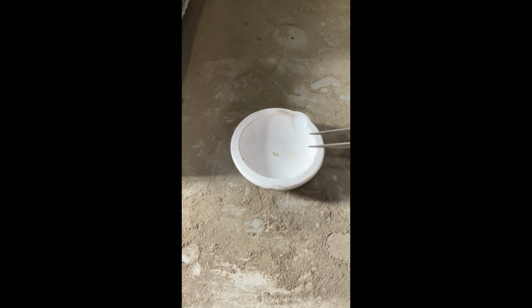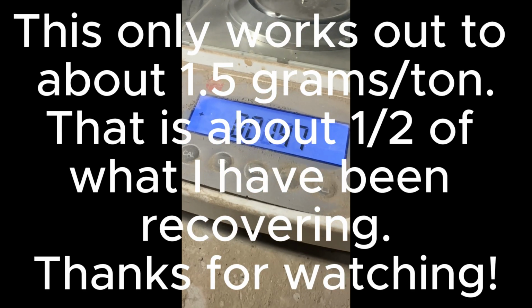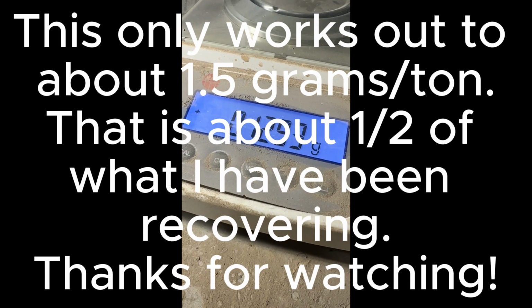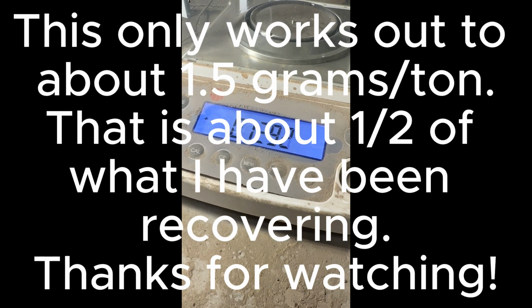Okay, there's the bead. Let's open up the door. Well, even less. Call it 0.13 grams. So I'll do the math real quick here and see what that works out to.